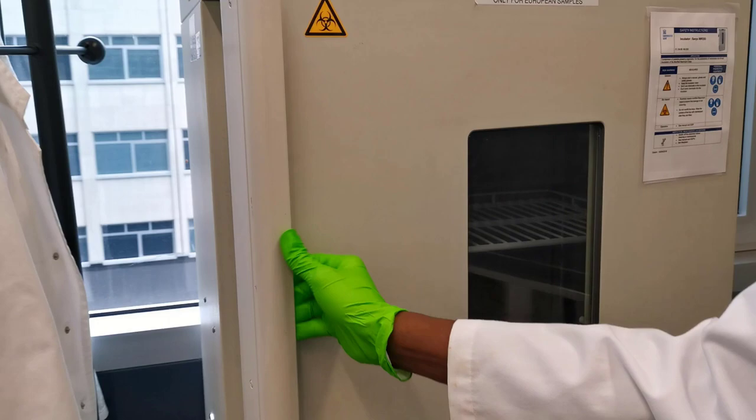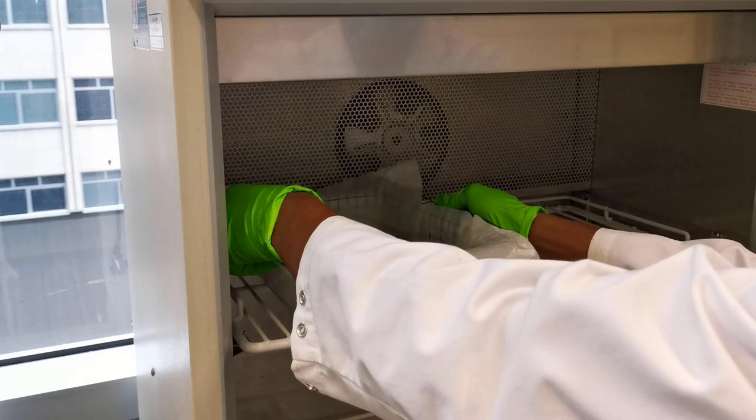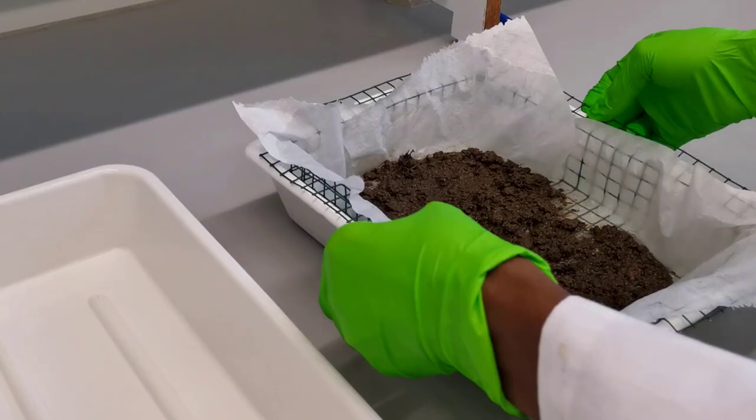During incubation for at least 24 hours, the vermiform motile nematodes present in the soil should have moved into the water. Now remove the extraction tray from the incubator and carefully remove the wire mesh which holds the soil from the plastic tray. Now collect the nematode suspension in a beaker.